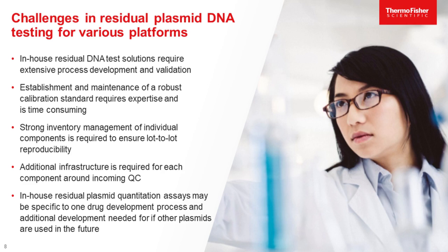The need to test residual plasmid DNA presents some challenges. Because there are not very many commercially available solutions, companies often have to develop their own assays. This is both time-consuming, technically challenging, and also labor-intensive. For example, establishing a reliable standard for a qPCR assay to be robust and meet the LOD and LOQ requirements involves time, cost, and skilled resources.